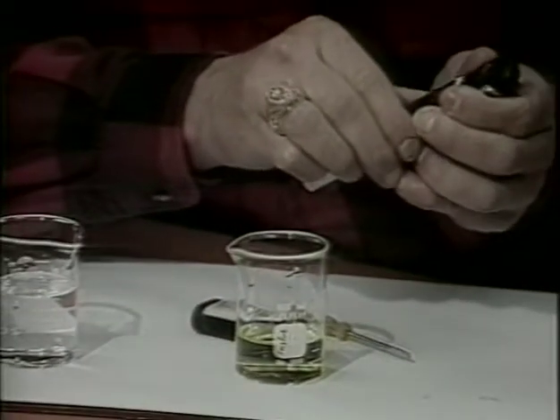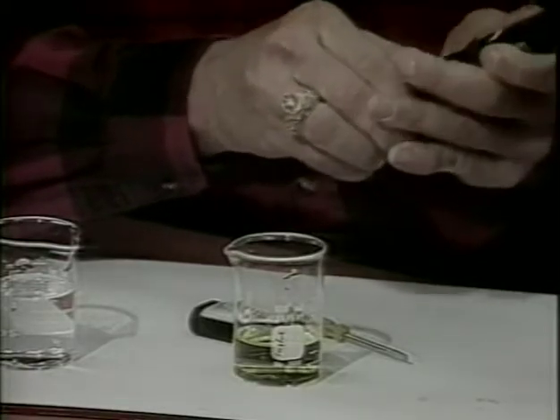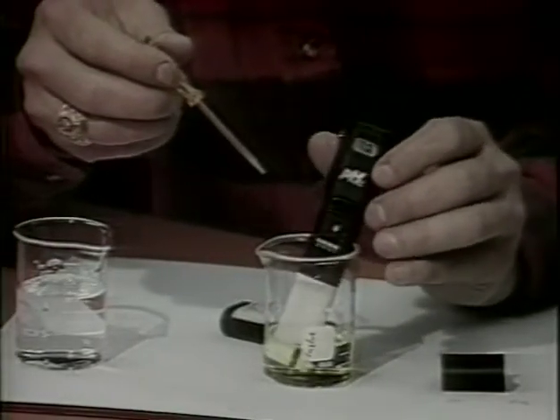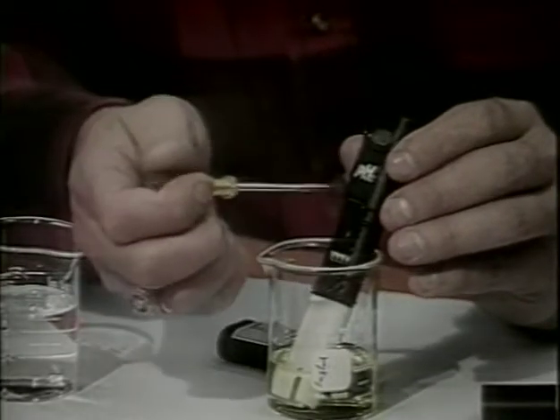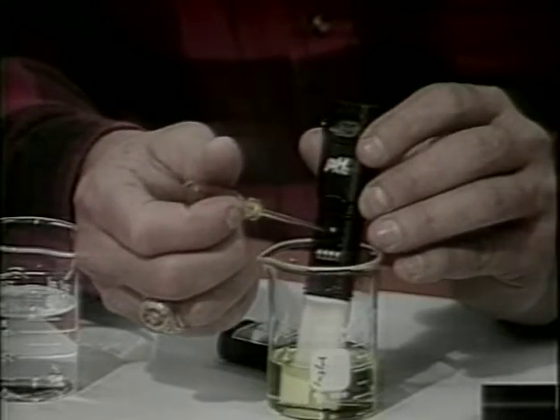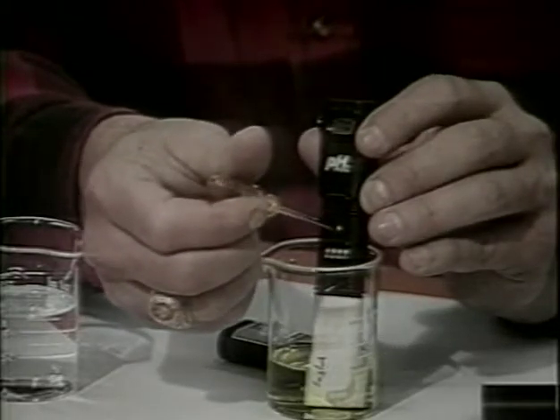Check the calibration of the meter by immersing the probe into a buffer of a known pH. The buffer should be within the normal pH range of the pond. Buffers may be purchased from scientific supply companies. To calibrate, adjust the calibration screw until the instrument reads the value of the buffer. Calibration should be done periodically, such as once every few days.